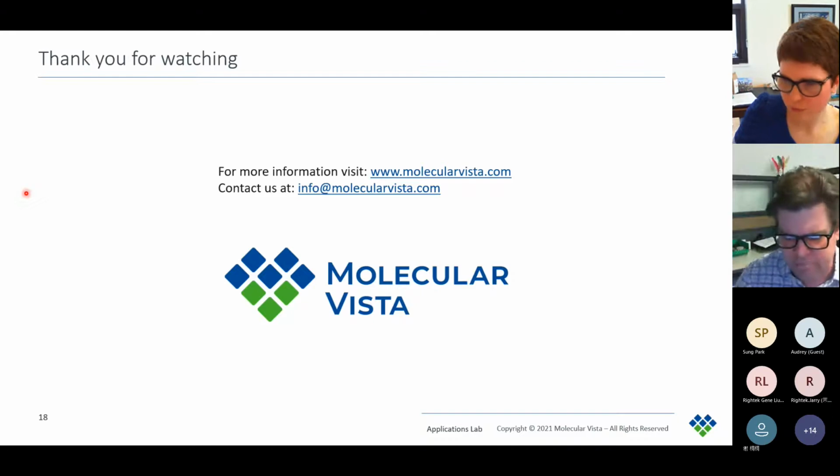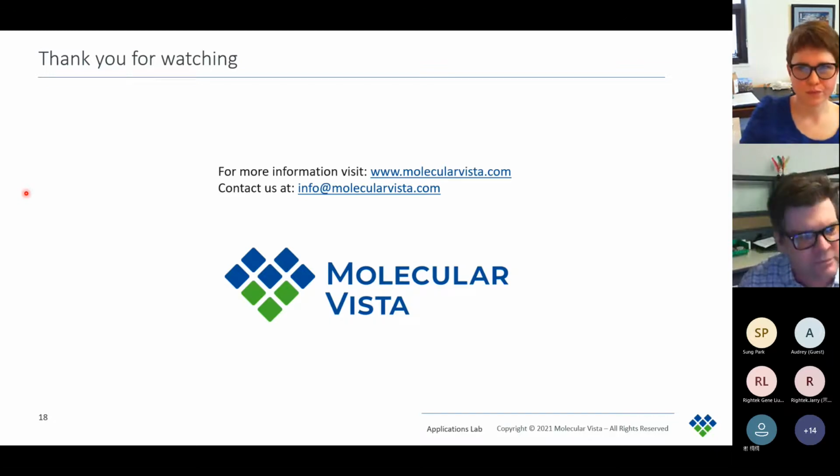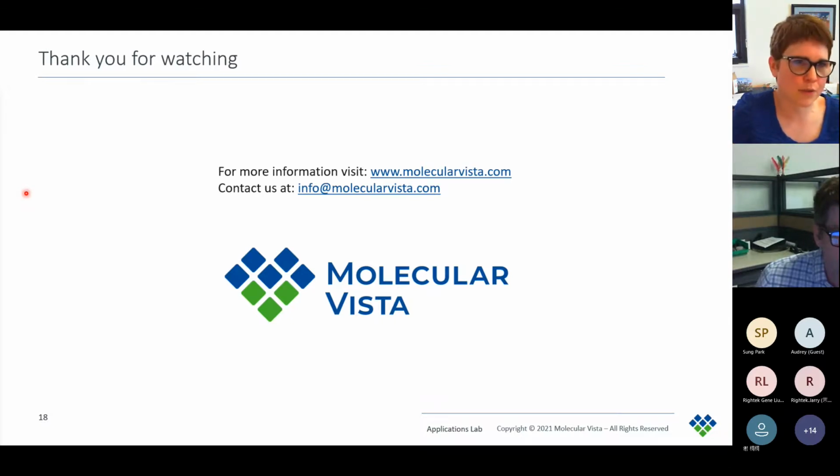The first one is on the polished cross-sectioning that was done. Was there any special preparation, or was it just really mechanically polished? Yeah, so what we did was just cut the pearl with a low-speed precision sectioning saw, and then polish it with diamond pastes down to 1 micron. And then what I usually do is add a step of colloidal silica that's 0.05 micron, I think. This gives me a very nice finish to do all kinds of other imaging at high resolution.